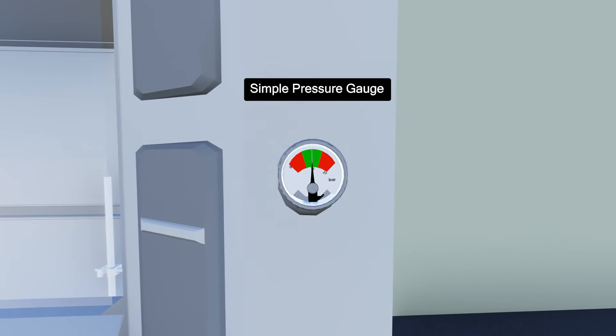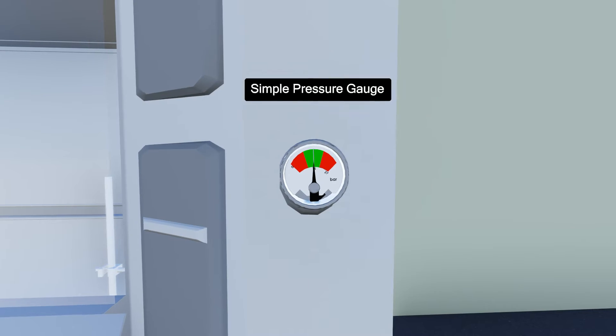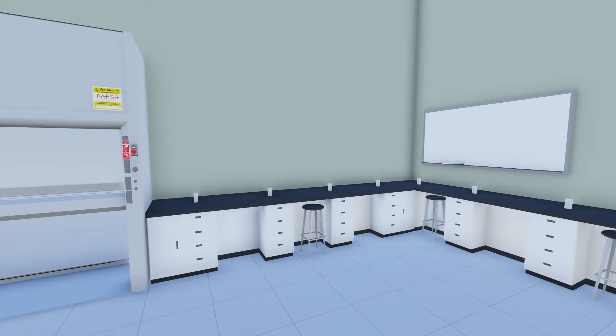Every PAFS fume cupboard system has a simple pressure gauge, which is visible on the front face of the fume cupboard, for a quick visual check of system health.